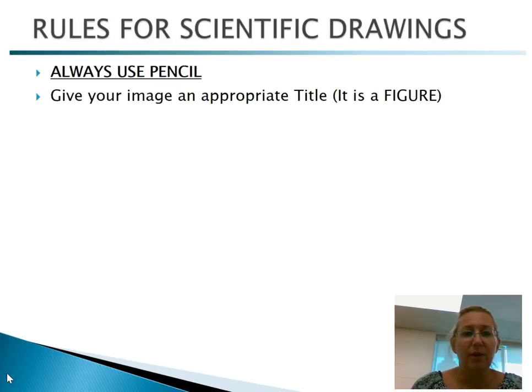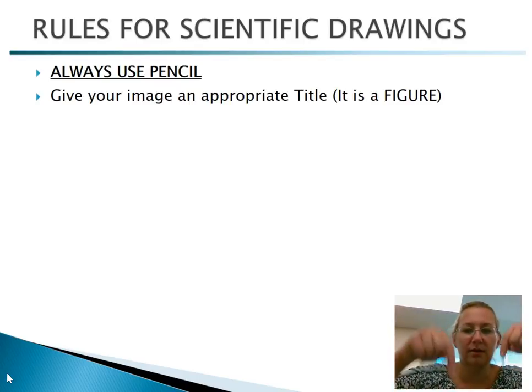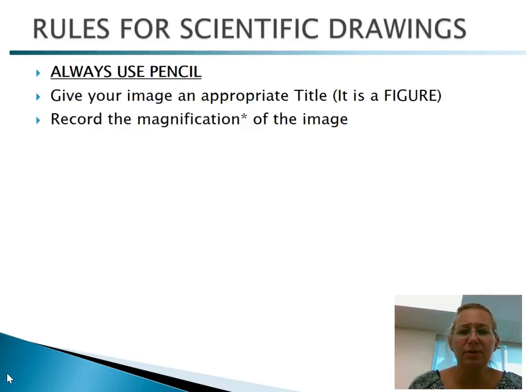Okay, you're going to need to give your drawing an appropriate title. A nice descriptive title. Now remember, a scientific drawing is a figure. So where do those titles go? At the bottom. Okay, now you're going to need to record the magnification of the item.